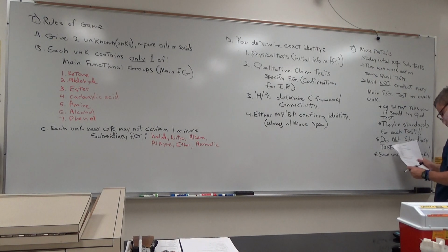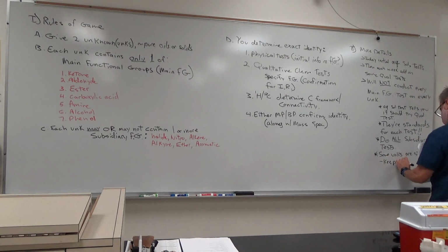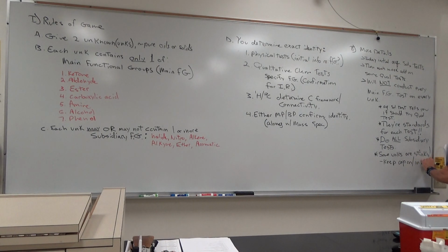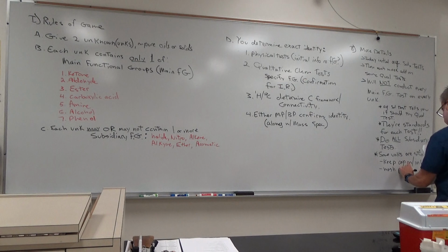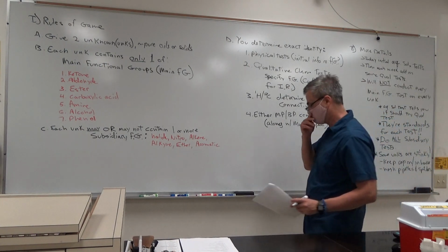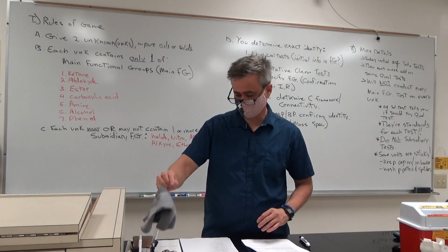Keep the cap on and in the beaker. Wash pipettes and spatulas. All right, almost done here.